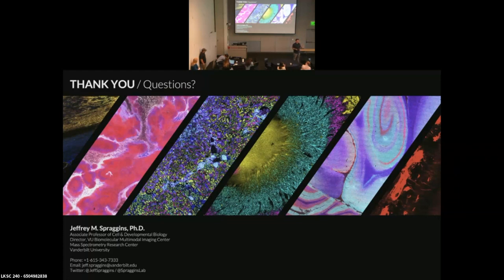We don't have a retention time, so we're not using retention time as a way to align those two data sets. You can use just a publicly available database to get tentative identifications. So LIPID MAPS, METLIN, those kinds of things you can throw your data against to get tentative IDs. And then what we tend to do, for all of our publishable data, is run LCMS to get a custom database that we compare all of our experiments to. And if there's still any questions about an identity, then we'll do fragmentation directly from tissue, and that answers it.